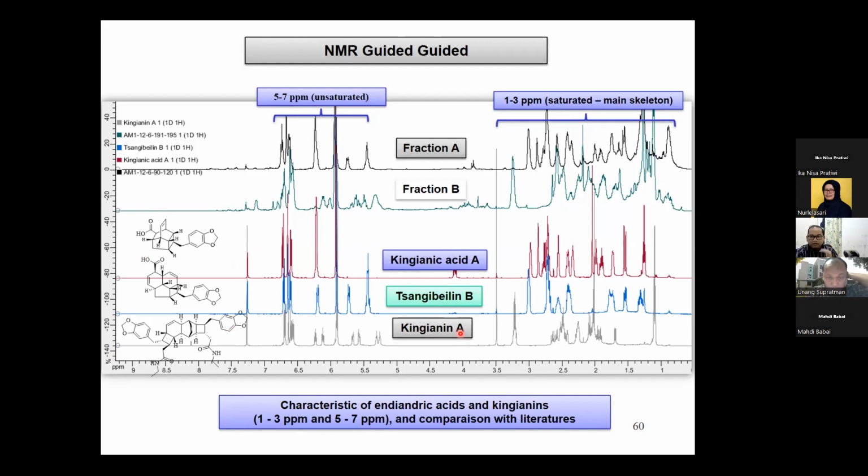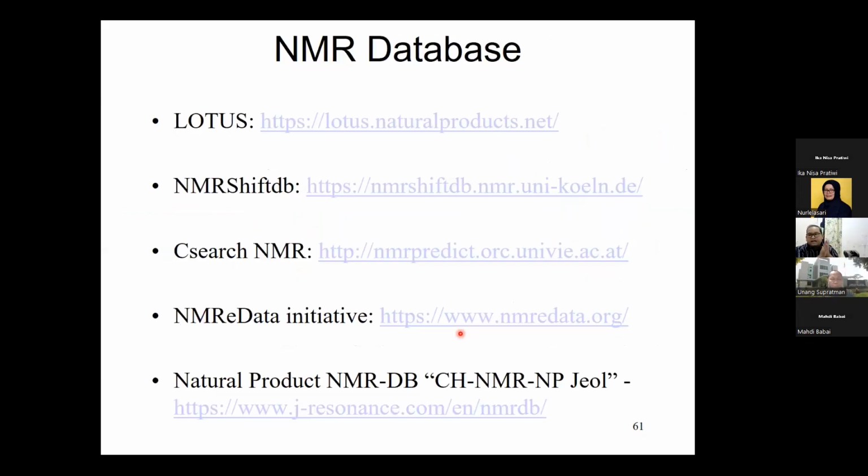It's very fast. But you have to be friends with NMR, because sometimes the operator doesn't want to run your NMR because your samples are quite huge in number. But if you can touch the NMR, you can learn NMR by yourself. It's kind of an advantage. So I just want to share a few things about recent findings.